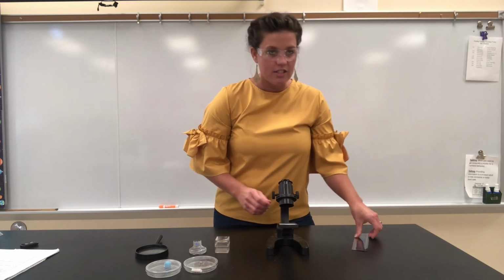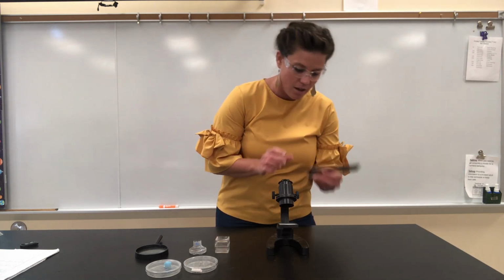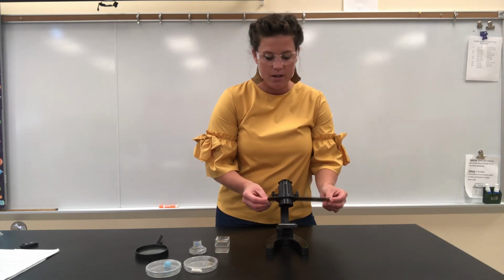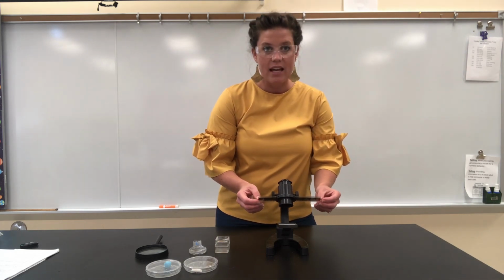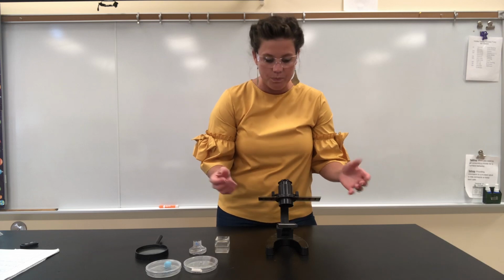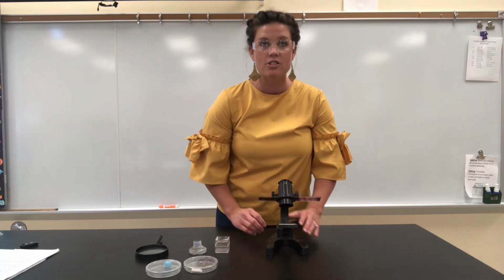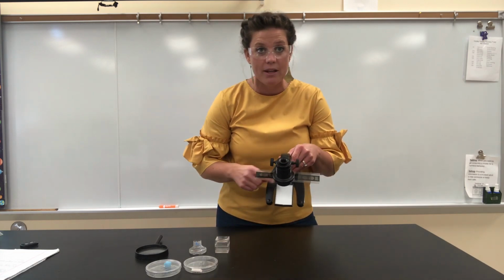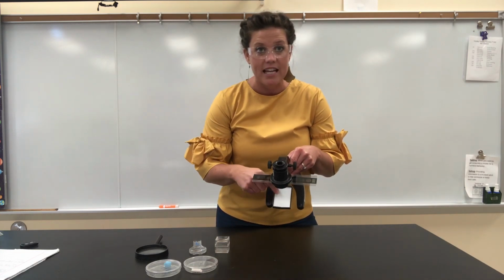So what you'll do is you will take your slide. In our microscopes, they slide into a slit here at the top. You adjust the slide so that it is where you want to view. Our light source for these microscopes is the lights coming from our ceiling. I'm going to tip the microscope up and you see this white rectangle.